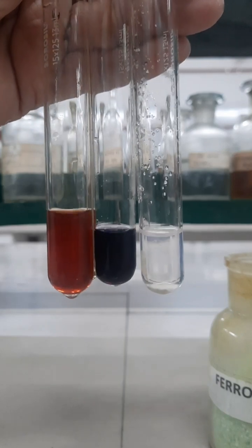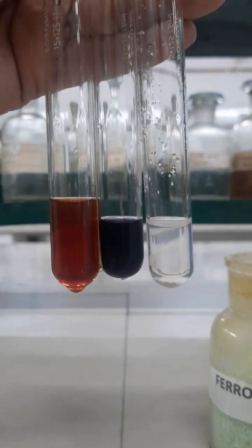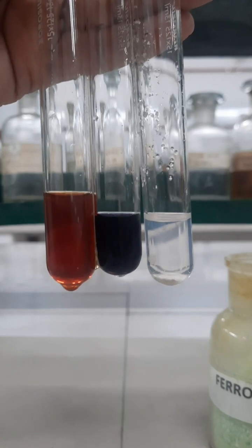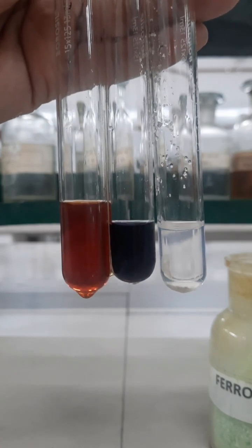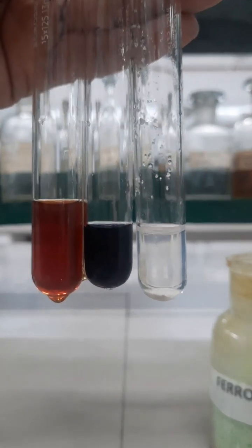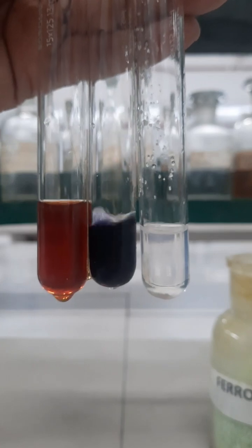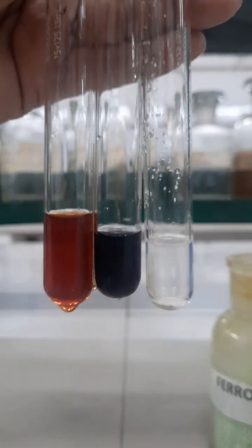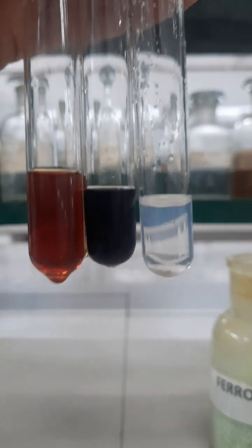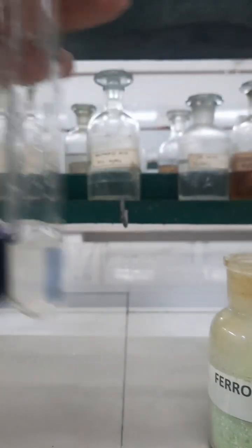Now I am diluting the mixture with distilled water such that the color will be observed properly. Add some more distilled water into the second test tube. Here you can see the appearance of violet color.